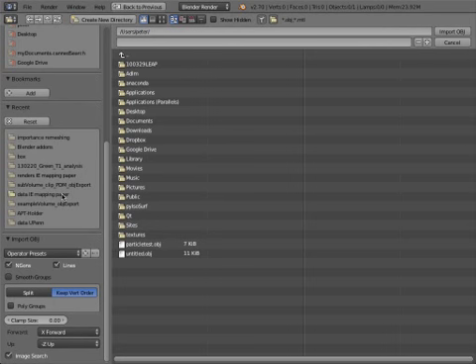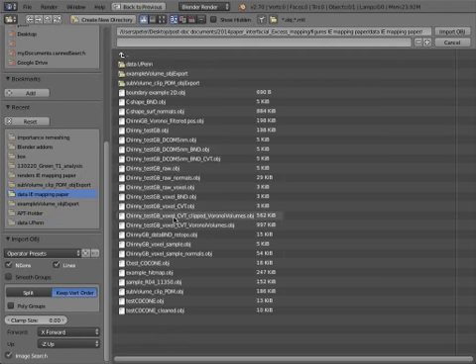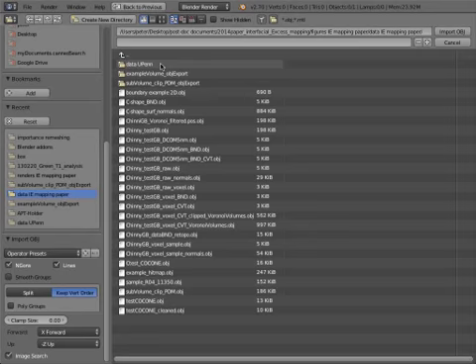And then I'll just choose some data. What do we have here? Subvolume, example volume, OBJ export, example.